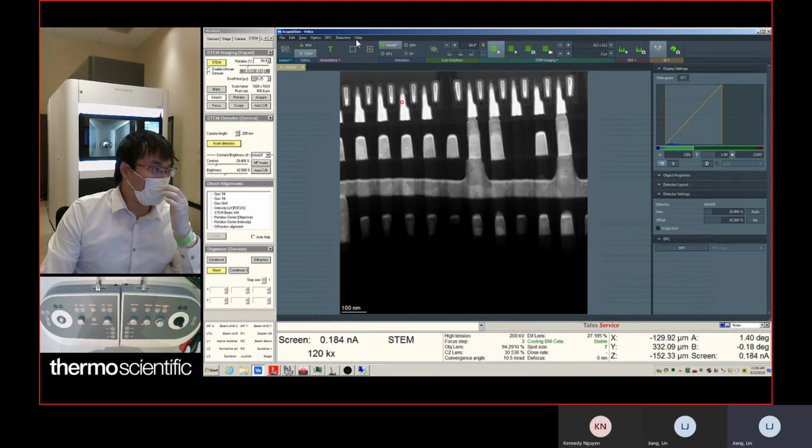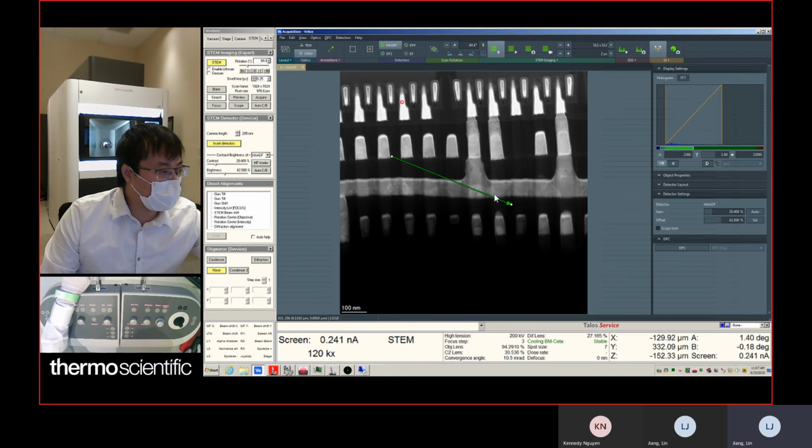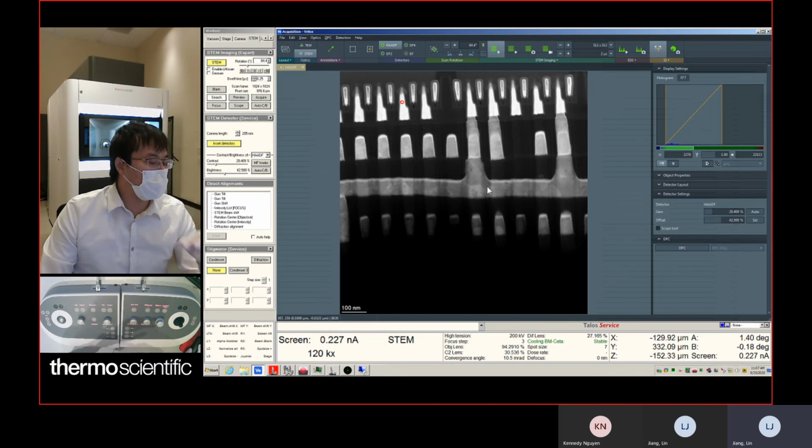Behind this option, we have layout, we have object. It's kind of a shortcut. So you can switch between TEM and STEM, add some annotation, add some text, draw some lines here, right? You can just use your keyboard.